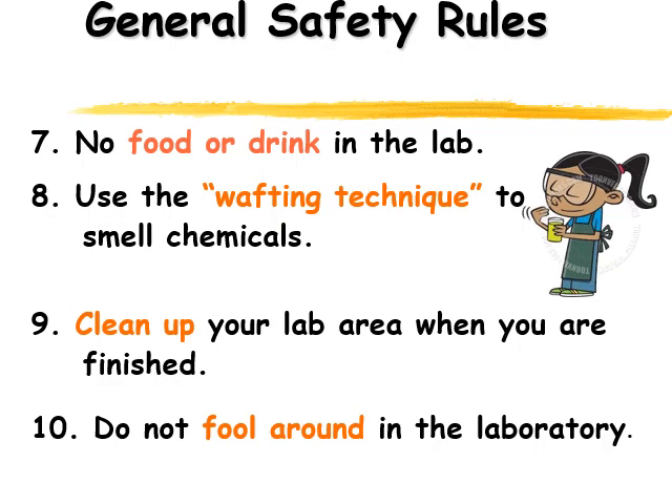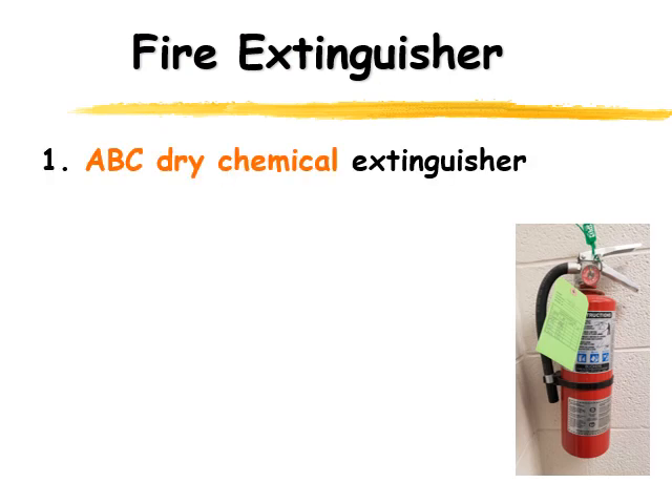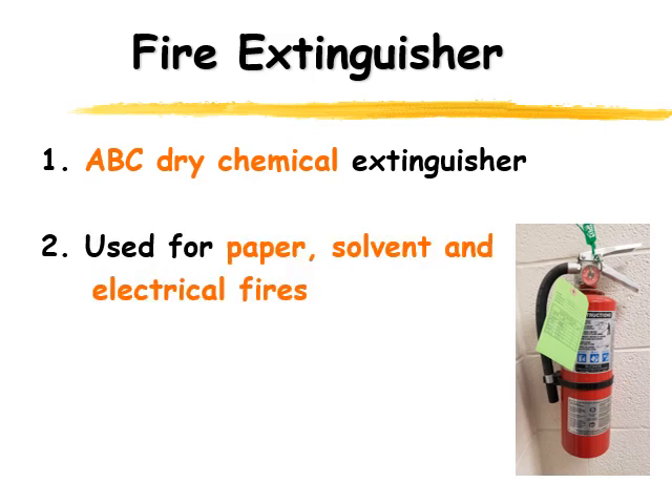Let's look at some of the safety equipment we have around the classroom. Different labs are going to have additional pieces of safety equipment — this is just what's in our classroom. One of the things we have are fire extinguishers. This type of fire extinguisher is an ABC dry chemical extinguisher, and it's a great one because it can be used for all sorts of fires — paper, solvents, and electrical fires.